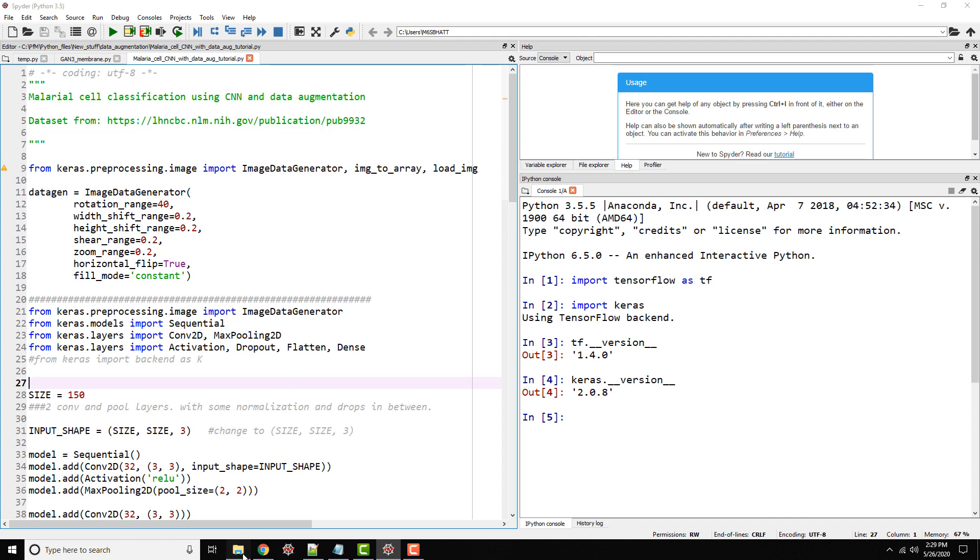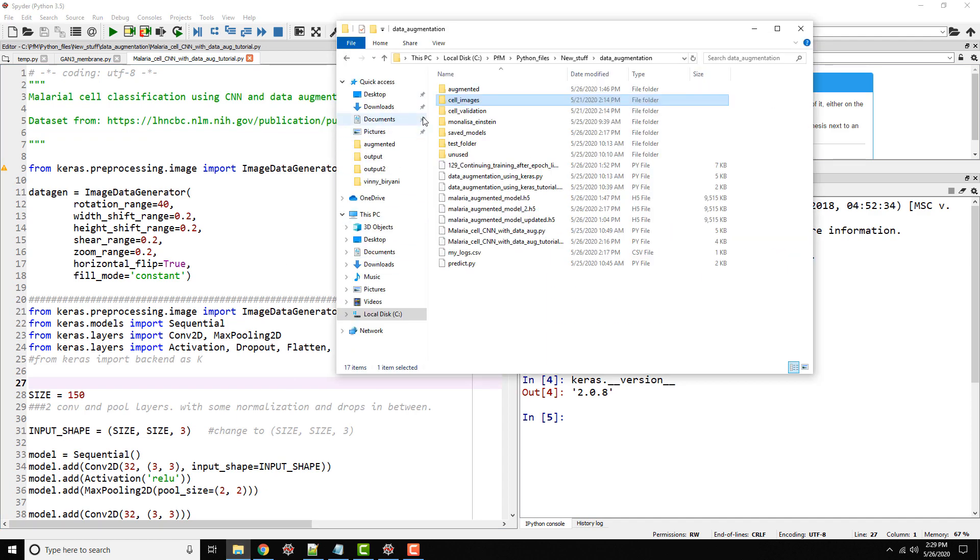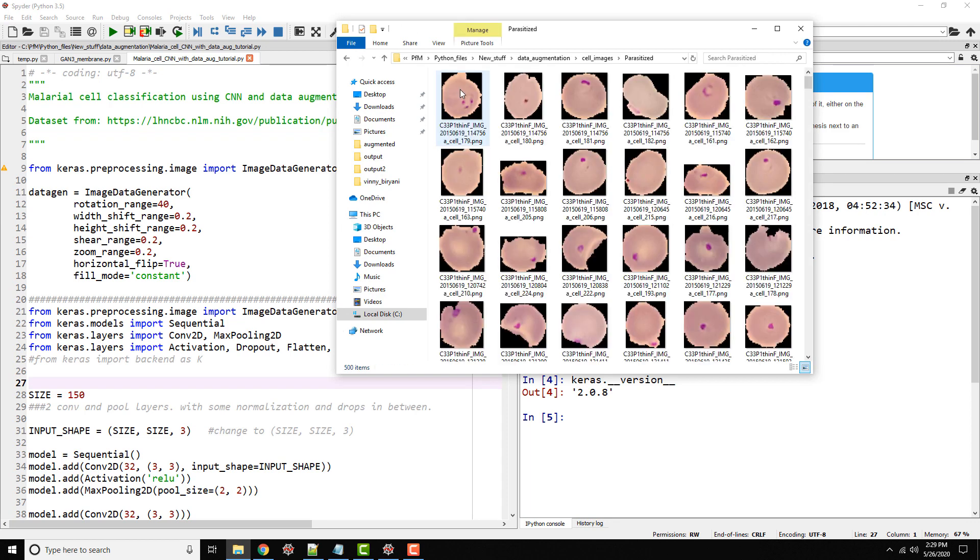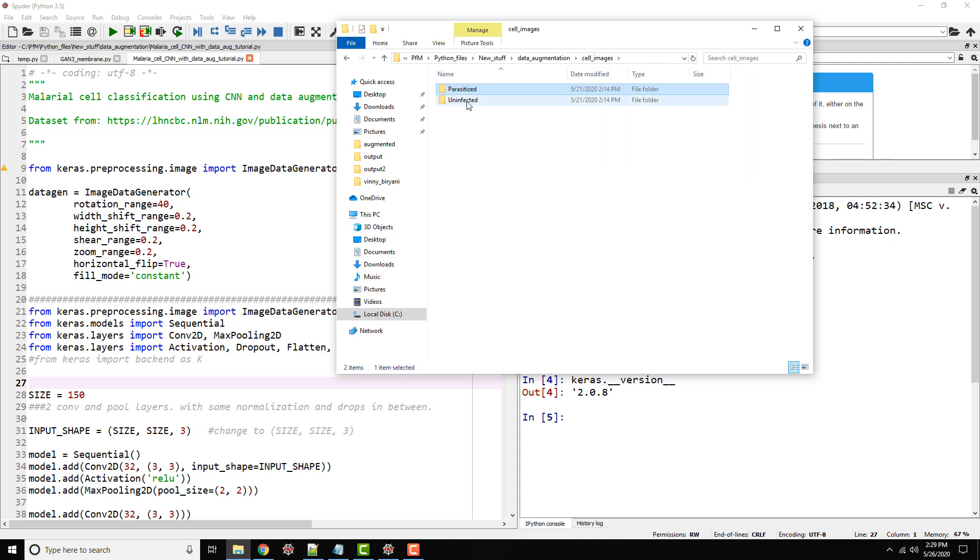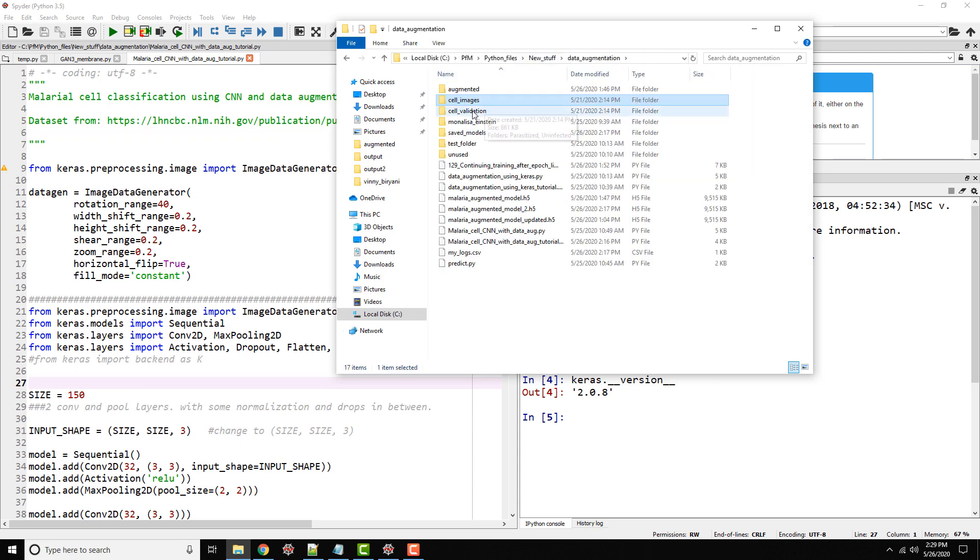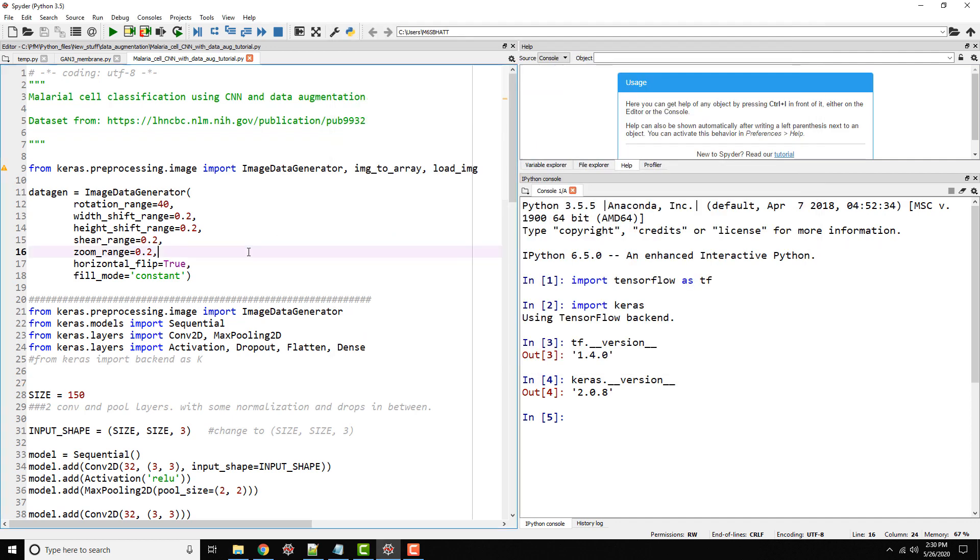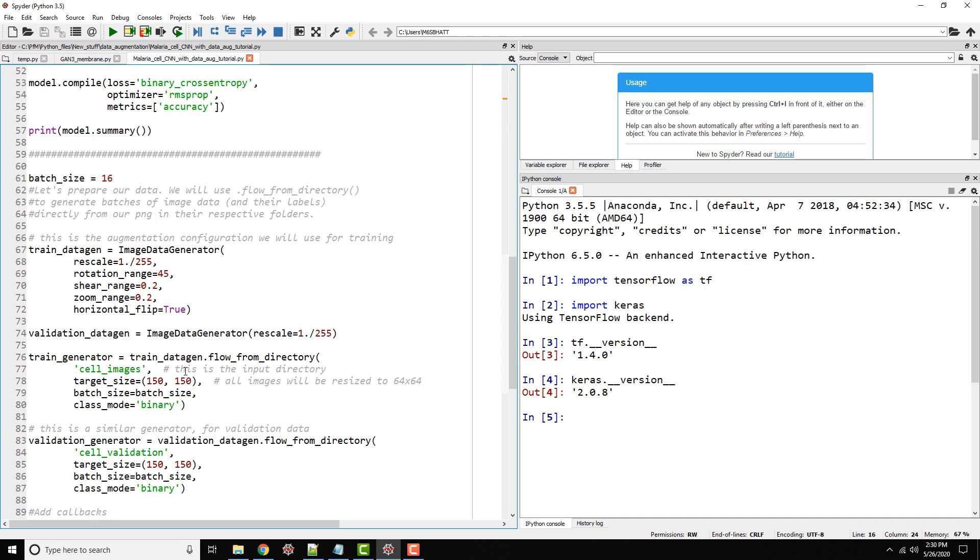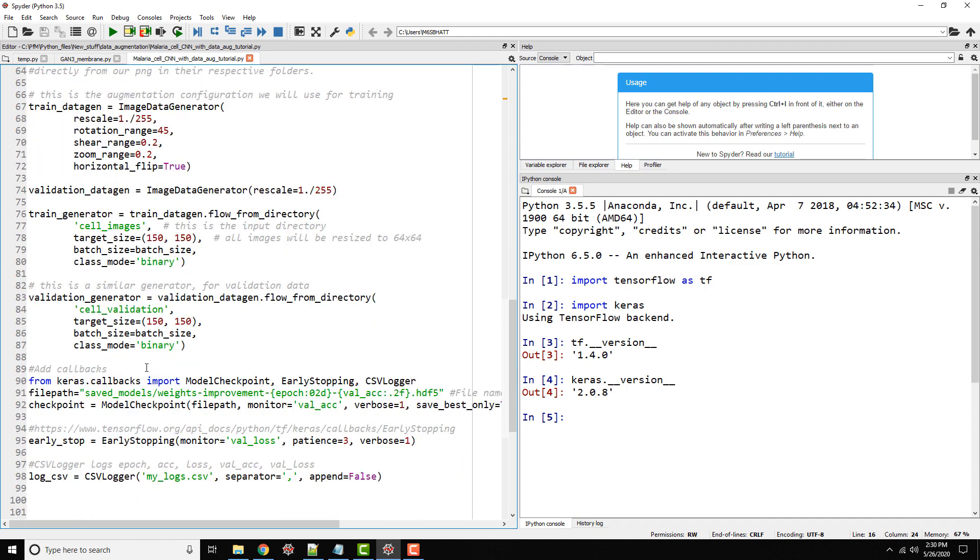Okay, so here is the code from our last few tutorials where I talked about classification of malarial cells using convolutional neural networks. I have a folder of cell images with subfolders parasitized with 500 images of parasitized cells and uninfected. Similarly, I have a validation folder. Please watch my previous tutorials on this topic so you can be up to speed with this.